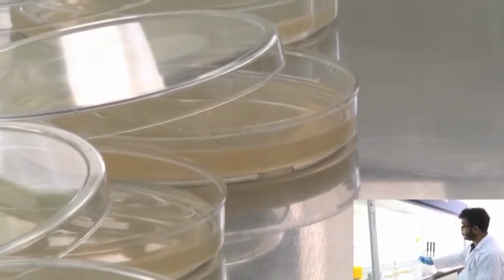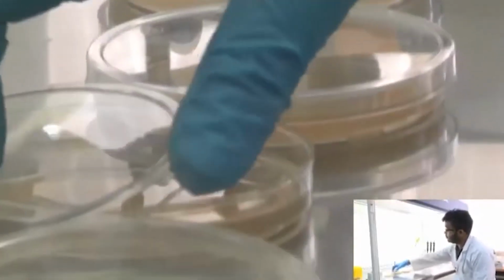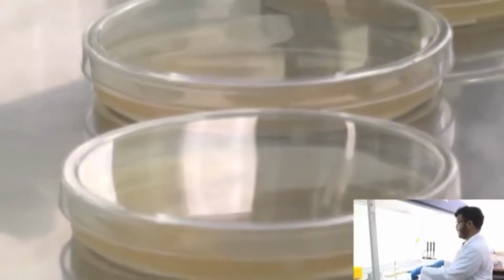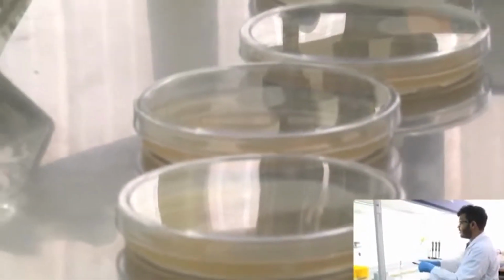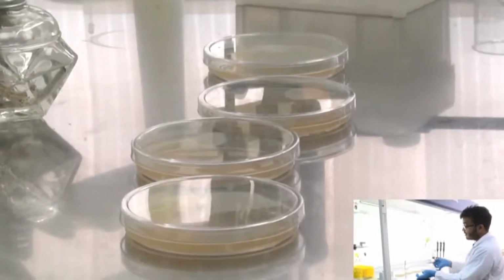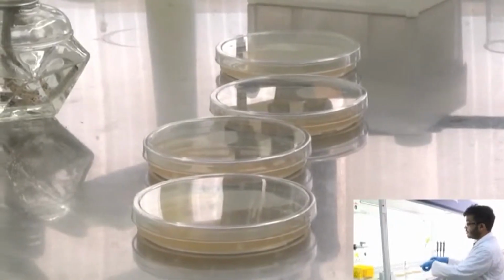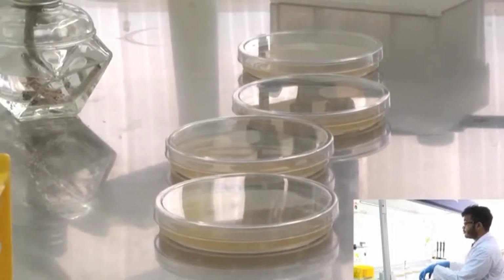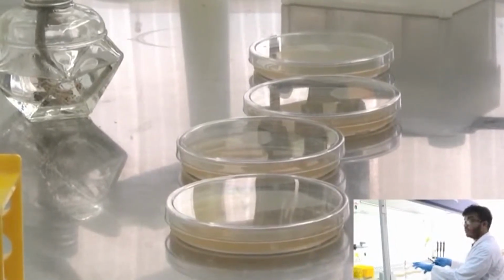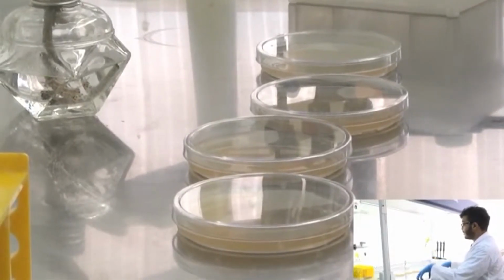And then, since these have solidified, I am just going to put the lid on for all of these. A very important fact that you must keep in mind is you need to label these plates. You need to label whether they are LB agar and what antibiotic is present and on which date you made it, and you should also keep your initials, because in case you are in a big lab people should be able to know which plate was made by whom, and so that when you are storing them in the 4° centigrade fridge they do not get mixed up and you can keep a track of things.